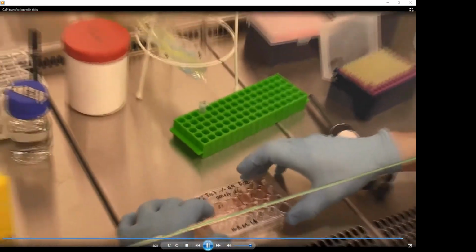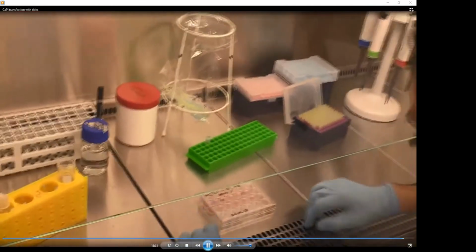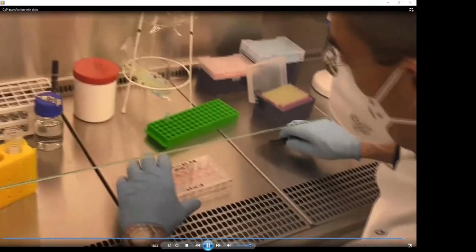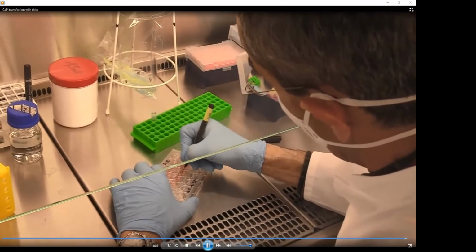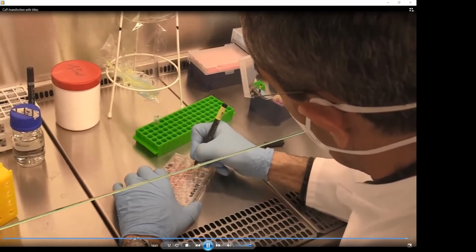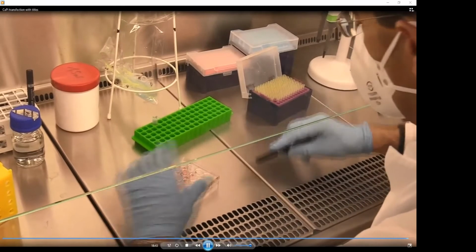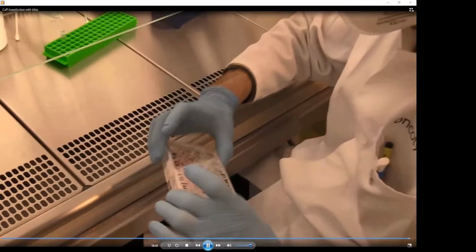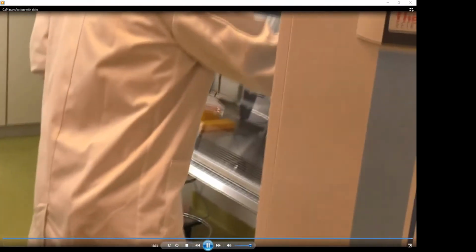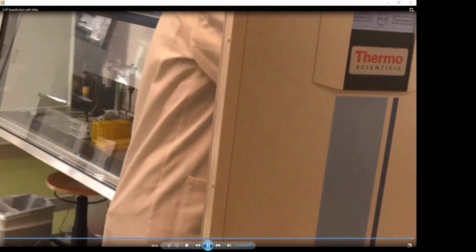And then the plate has to be labeled with when the transfection was done. So the time is important because afterwards it will be incubated, and in one part of the samples the medium will be replaced with fresh medium where we add lithium chloride.